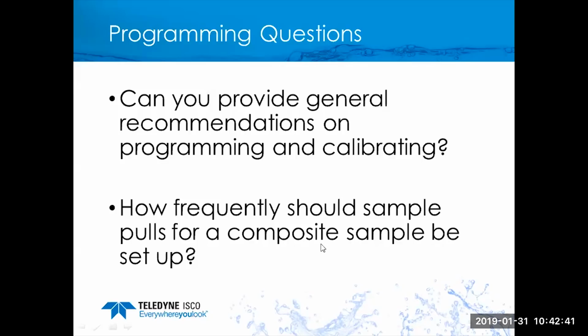My rule of thumb is to configure the unit such that on an average flow day, 96 samples are going to be collected, which works out to an average of 4 samples per hour. I will also configure the unit so that in the event that I have an above average flow day, I have room left in the bottle to collect more samples as a result.